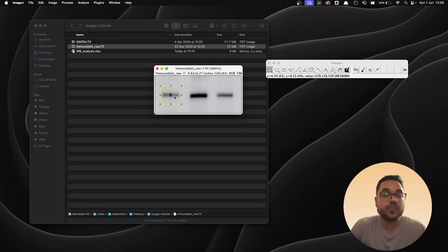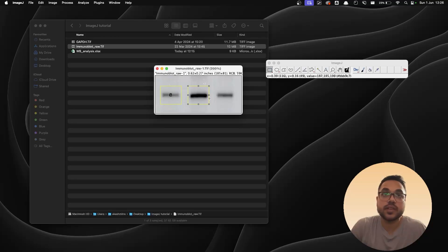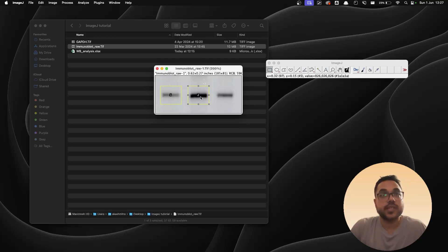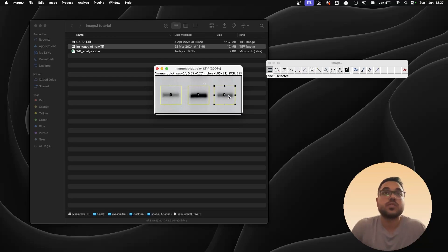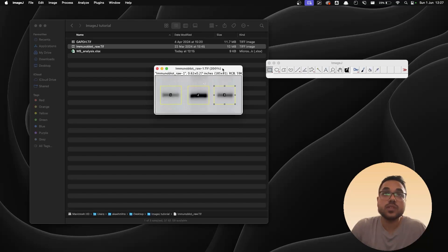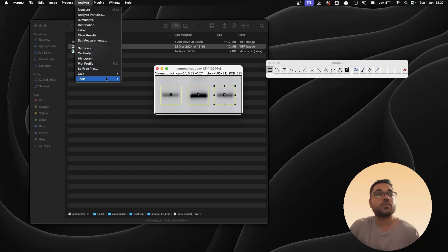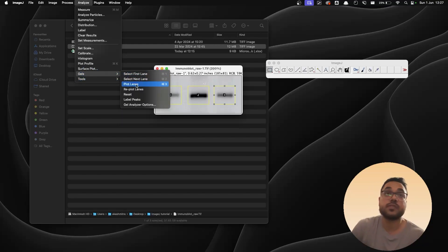Now we're going to duplicate this rectangle just by dragging it onto the next one, and we're going to hit Command+2. There's going to be a second lane. The same thing for the third one. Command+2, there's going to be a third lane. Once that is done, again go back to Analyze, go back to Gels, and you have something called Plot Lanes. The shortcut for which is Command+3.